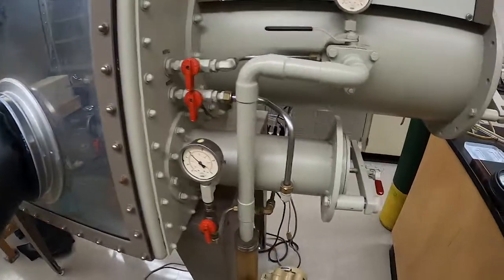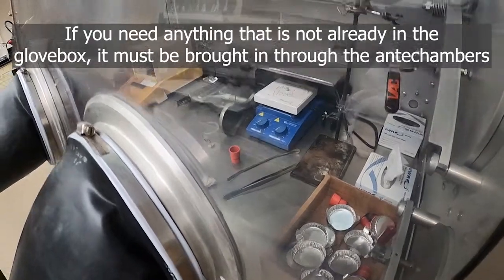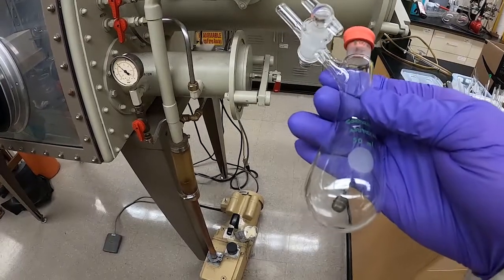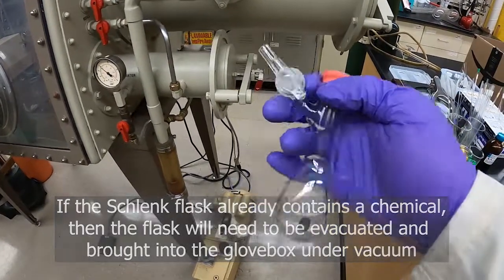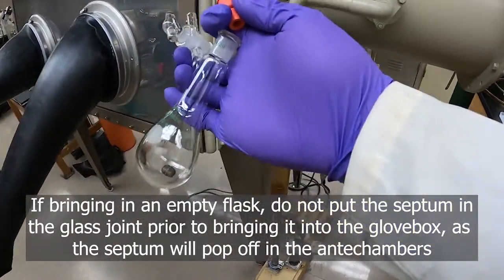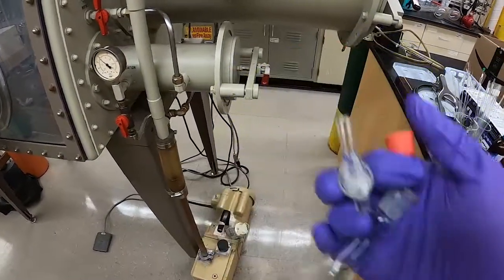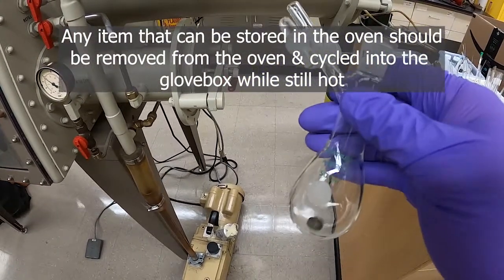To bring things into the glove box, remember that anytime you're working in the glove box you need to bring anything you want to have in there with you. That includes things like a stopcock, septum, stir bars, and that sort of thing. If you're going to bring in something like this Schlenk flask, it either needs to be under vacuum — closed with a vacuum on it — or preferably open without the septum installed.